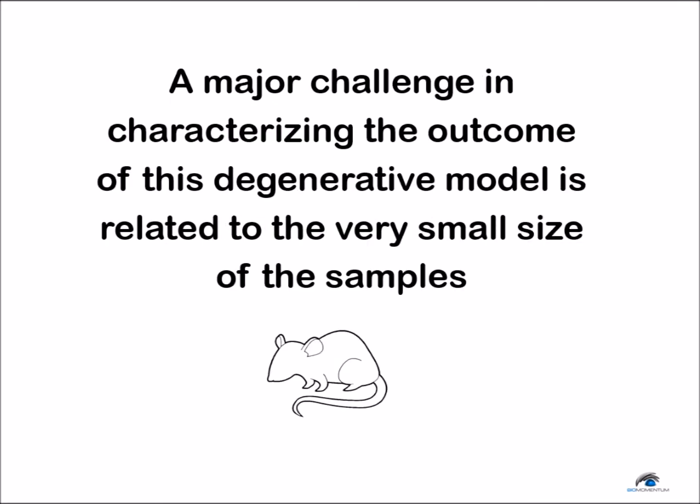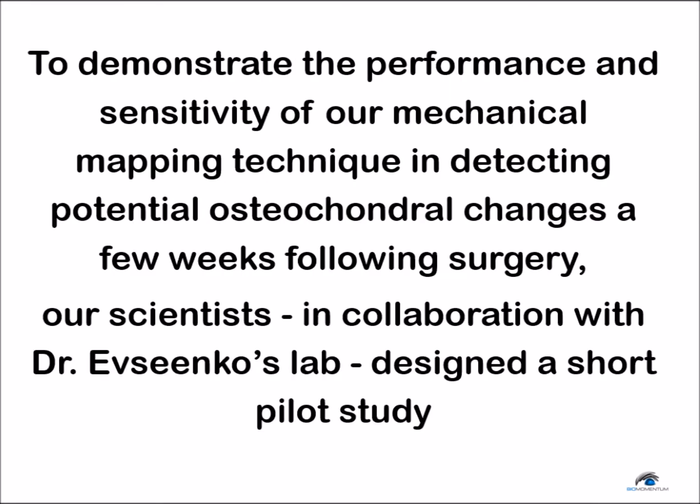A major challenge in characterizing the outcome of this degenerative model is related to the very small size of the samples. In order to demonstrate the performance and sensitivity of our mechanical mapping technique in detecting potential osteochondral changes a few weeks following surgery, our scientists, in collaboration with Dr. Evseenko's lab, designed a short pilot study.